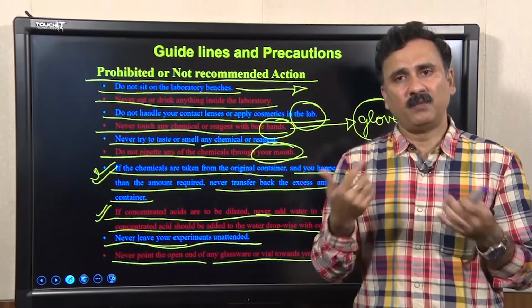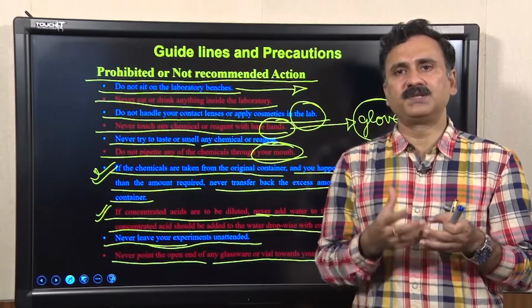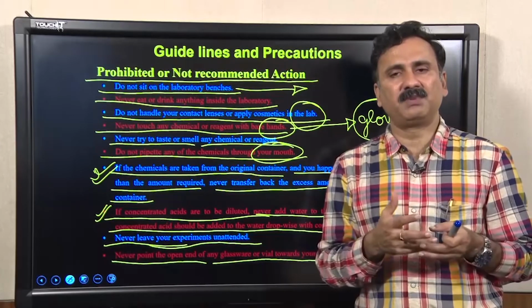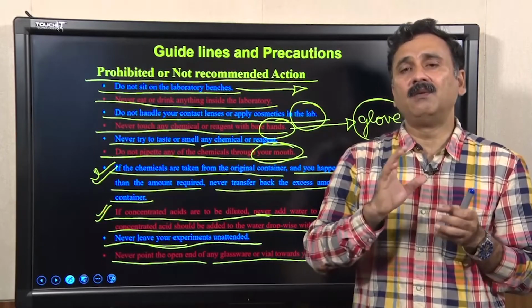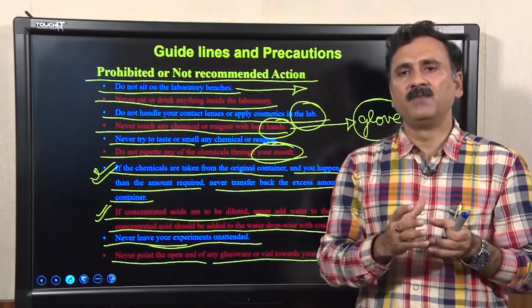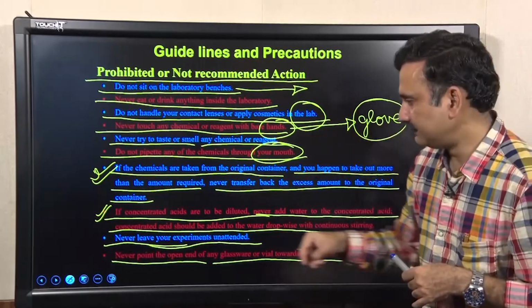That is why when you open any kind of chemical bottle, you do not know what the pressure inside could be. That is why it is important that you open it keeping the vial's mouth away from your body, and not towards somebody else as well.